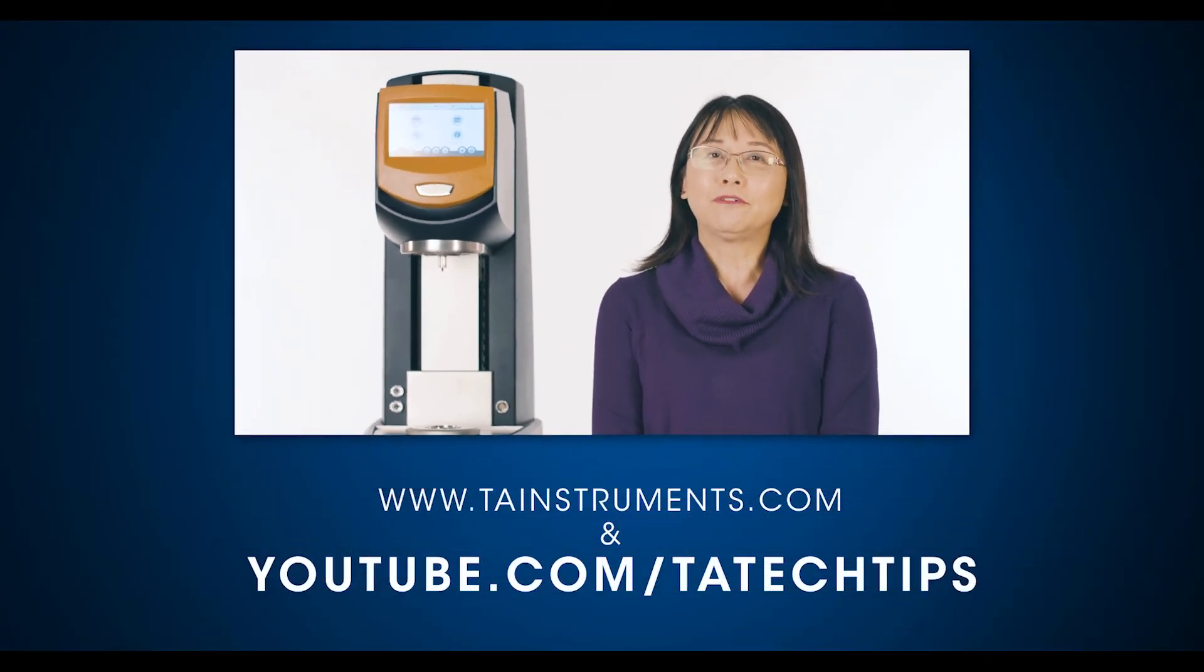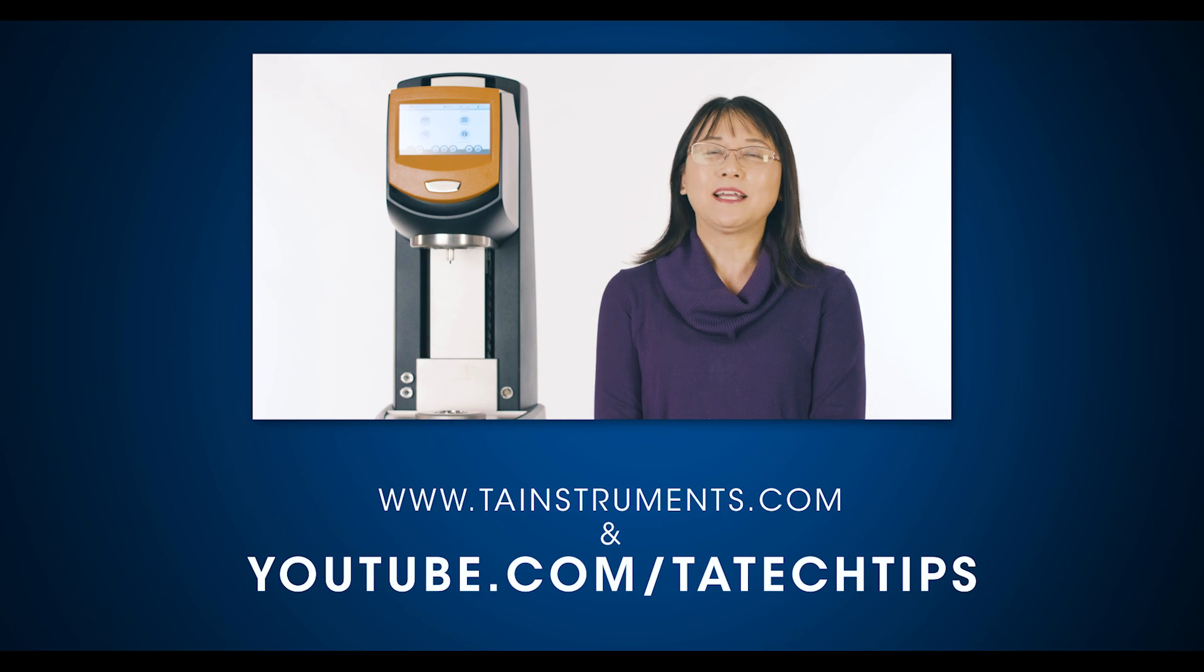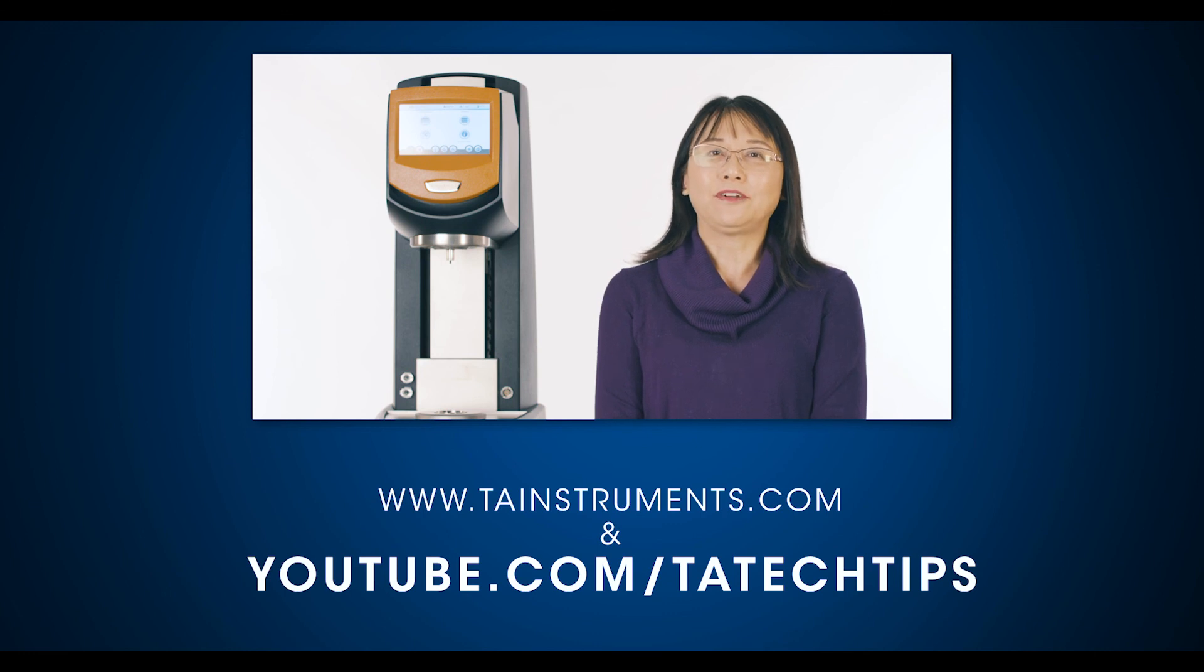In this TA tech tip, we have learned how to use TRIO's Express mode to set up a rheological experiment. This Express mode is a great feature in TRIO's. It is especially helpful for new rheology users and those with simple and well-defined experiment needs. Please stay tuned for more helpful TA tech tips and thank you for your interest.